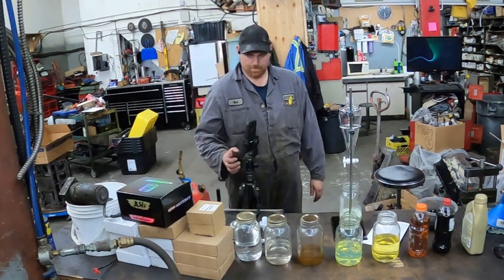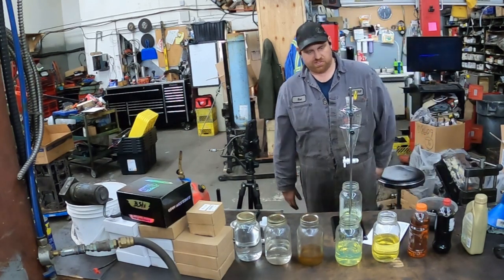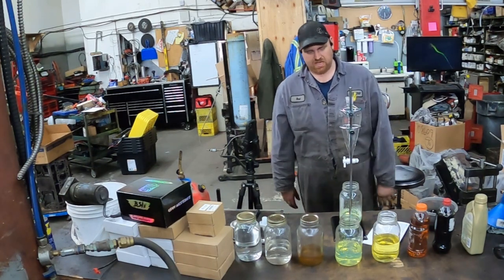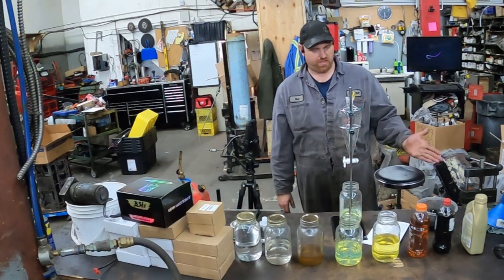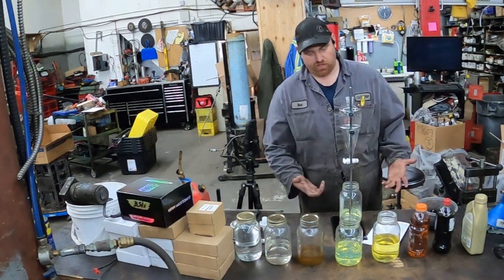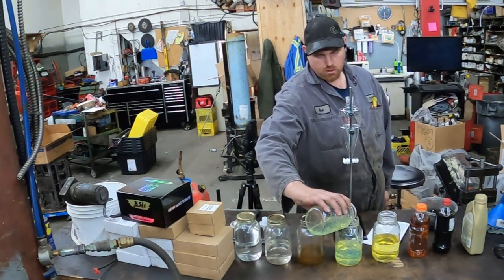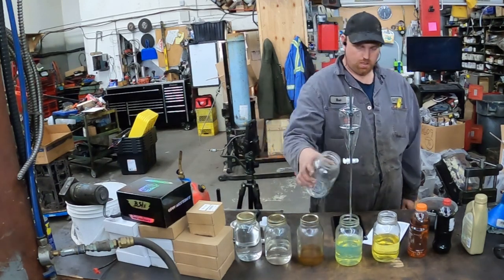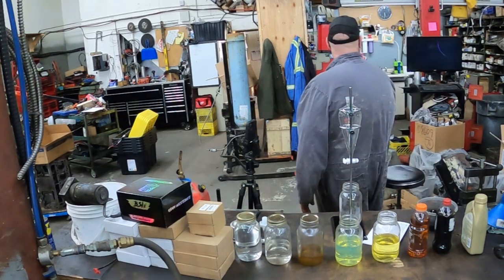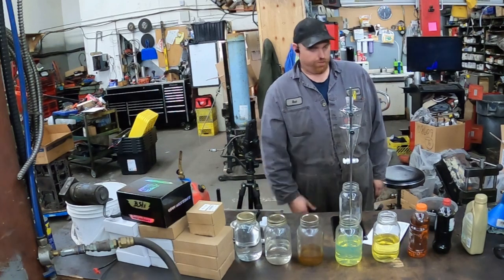Okay, so that was the diesel fuel. I'm just going to let it sit for a couple seconds and drip out. I don't think a little tiny bit of contamination is gonna hurt us anyway, because we're going thin to thick. A drop of diesel fuel in there isn't really gonna hurt us. That's how much we got out of that. Alright, so that was diesel fuel — now we're gonna go on to biodiesel.